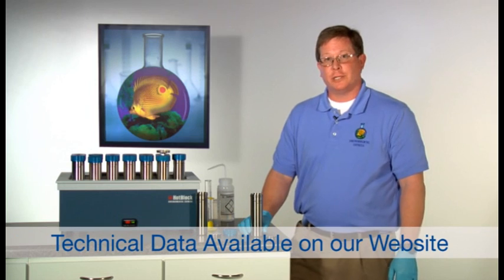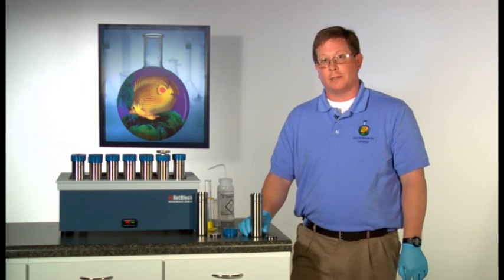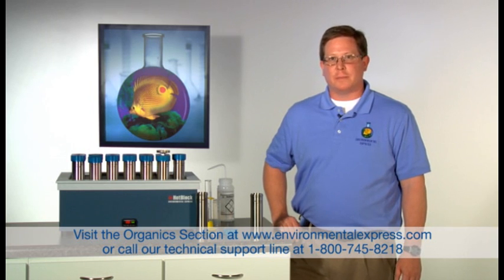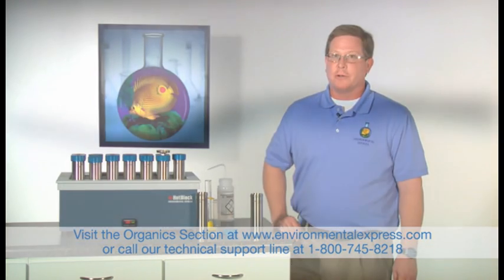The sample is now ready for filtration, concentration, clean-up, and analysis. Thank you for taking the time to watch Environmental Express Tech Tips on the Soil Excel System. We appreciate the opportunity to earn your business.